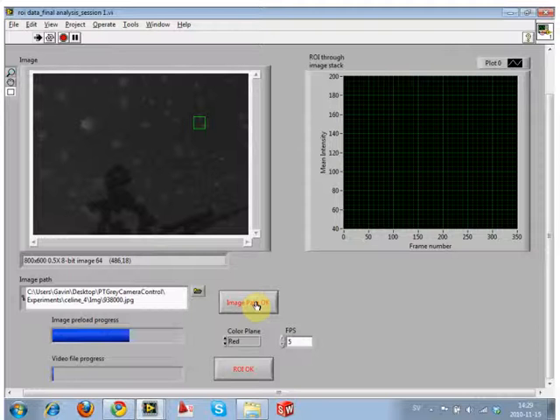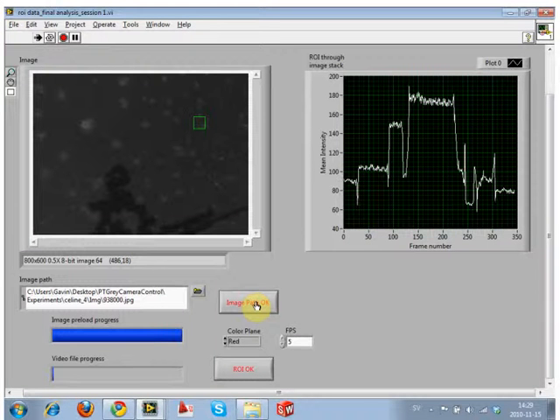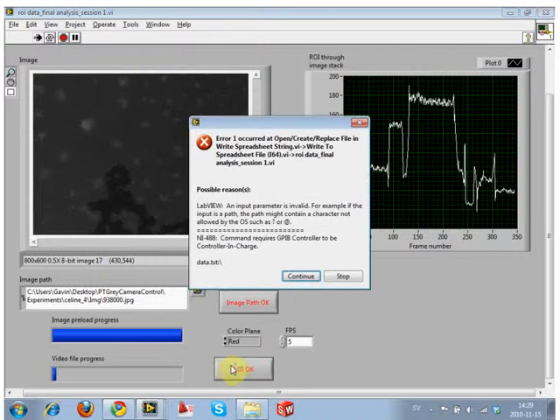It was like, it's got to have something to do with opening the files, because it was failing at opening the files. So there's only so many places, like I was kind of showing you. On this top, let's just finish this first. Oh, it's still open. I'll let it continue.